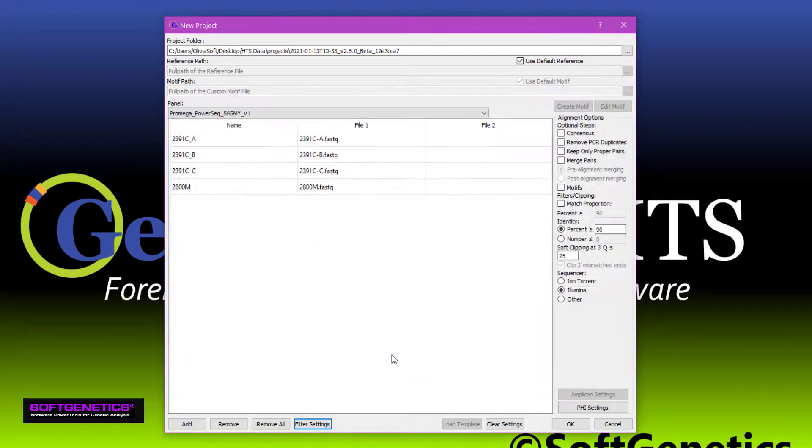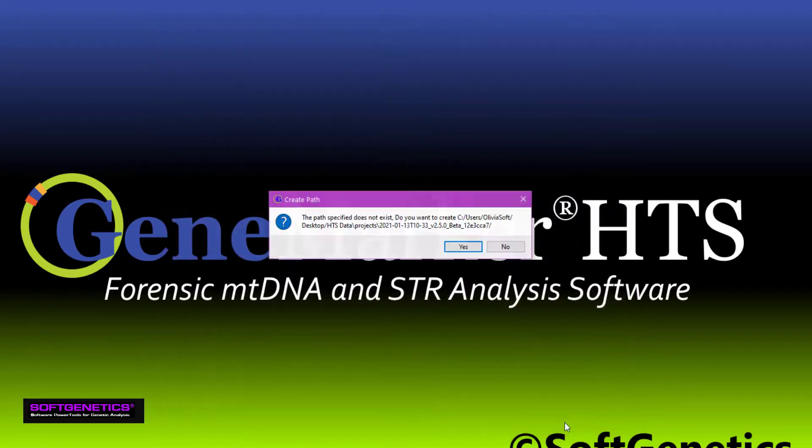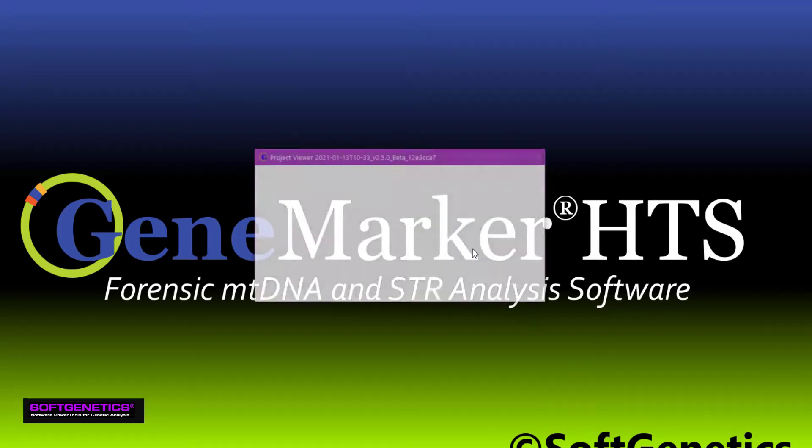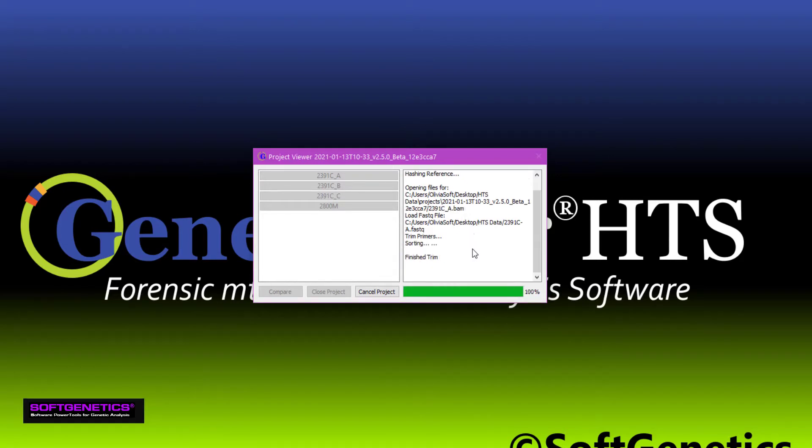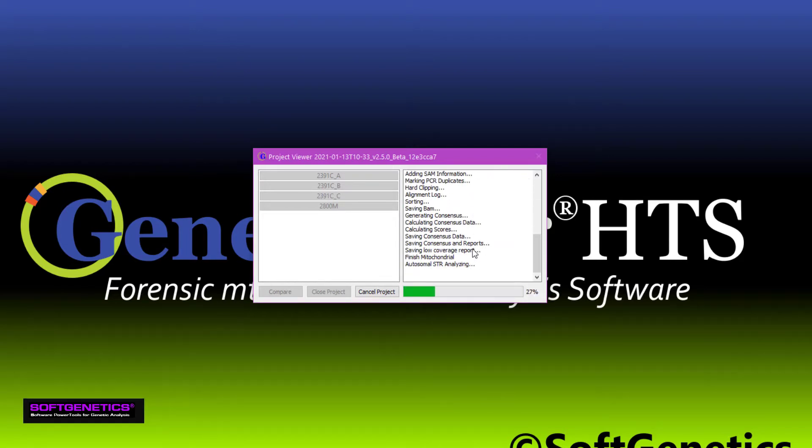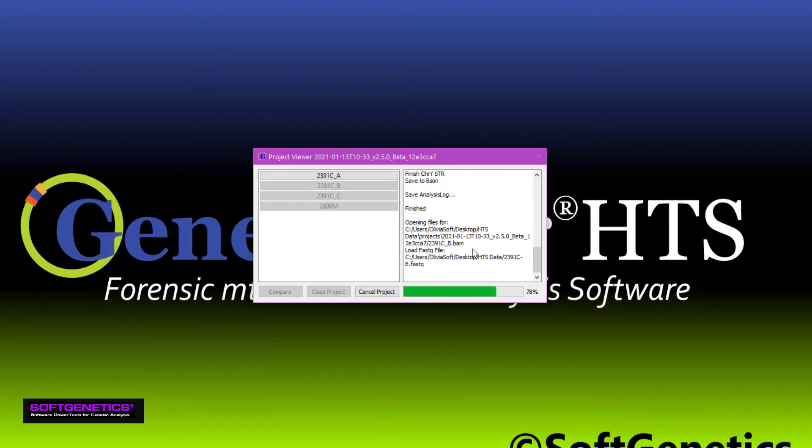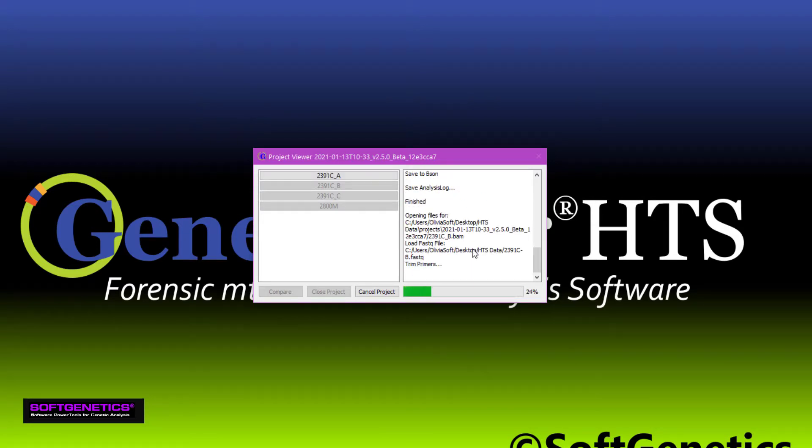Once all of the settings have been made, click OK. This window is saying that a folder will be created within the data folder to hold all of the reports and files. As samples finish, they'll become available in the viewer window. You can open up and view a sample while the others are being aligned.